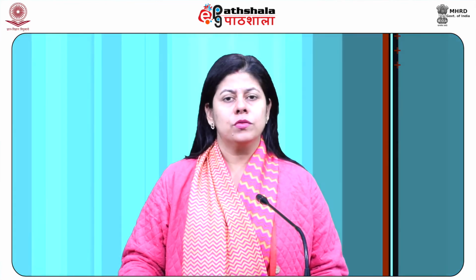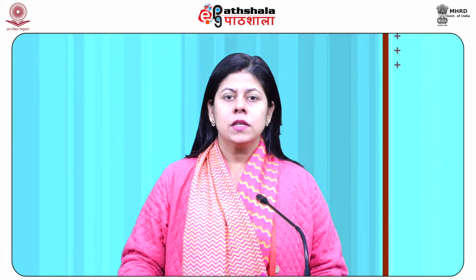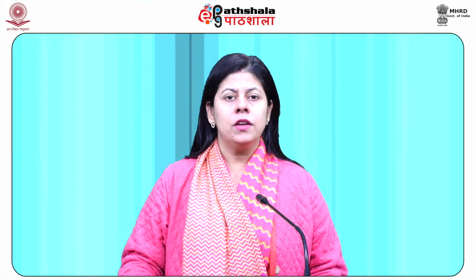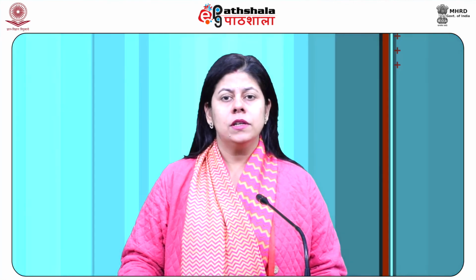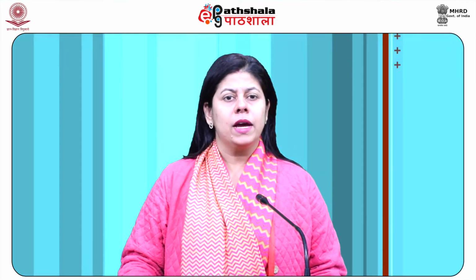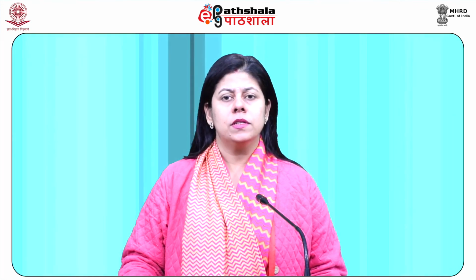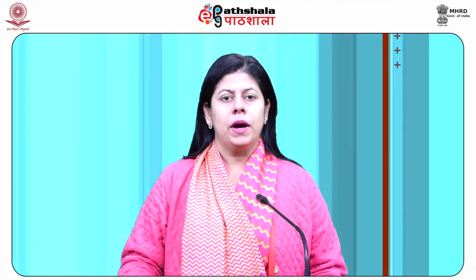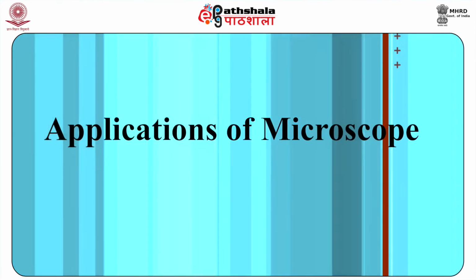This type of microscope made it possible to study the cell cycle. The phase contrast microscope is widely used for examining such specimens as biological tissues. It is a type of light microscopy that enhances contrast of transparent and colorless objects by influencing the optical path of light.